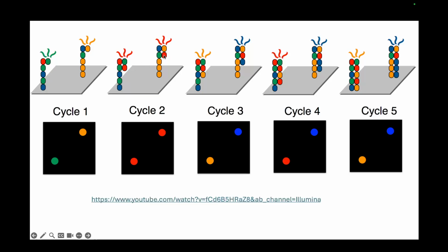Again, these are ddNTPs, you convert them to dNTPs again, and then the next base gets added. So one after another, you can control how bases are getting added, and at each position a ddNTP is getting added. You are getting a picture, and you know what base is getting added. So like this, you synthesize the whole strand.